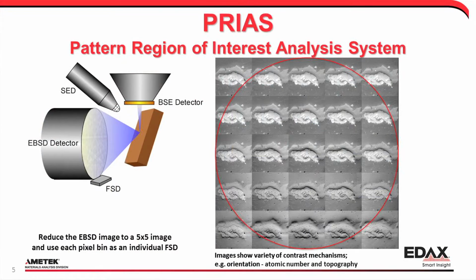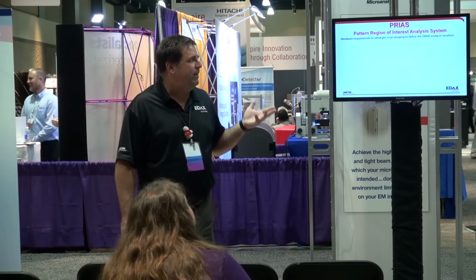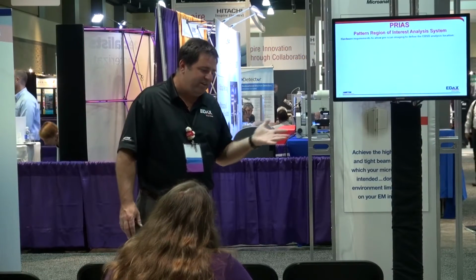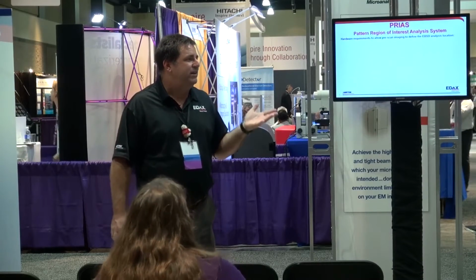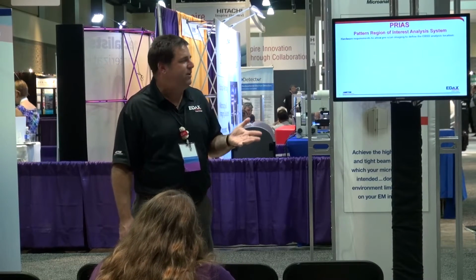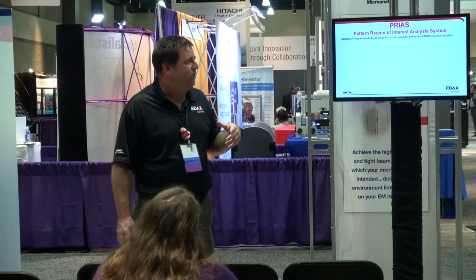And so we'll talk a little bit about the different kinds that we get out. The way I've seen it, what you want to do is get all these images and then see if there's a way to isolate and find the specific contrast you're interested in to show whatever you want to show. When we did this, really what we tried to do is say, we can save the patterns and do this analysis, and we do that, but we wanted to use it as an imaging tool. And so we asked, what's required to use this as an imaging tool?